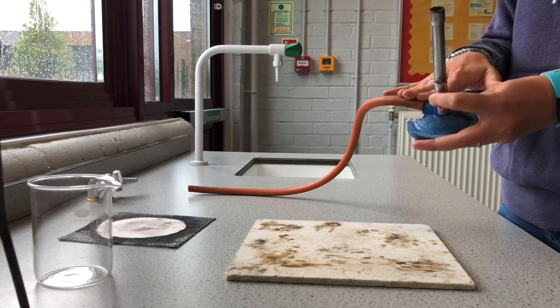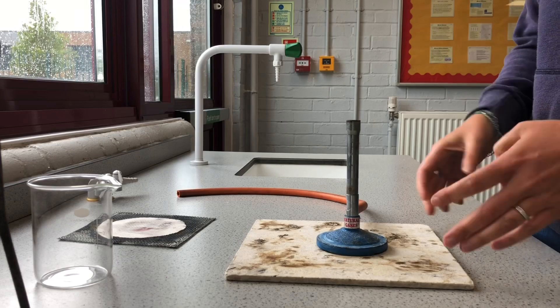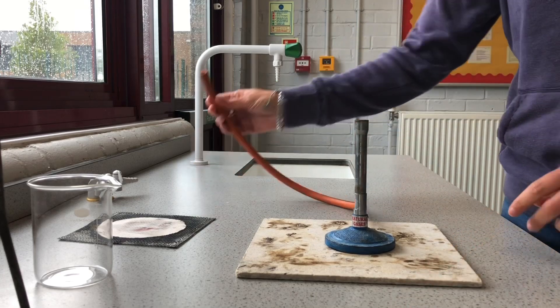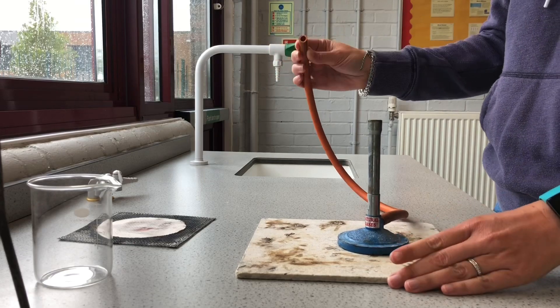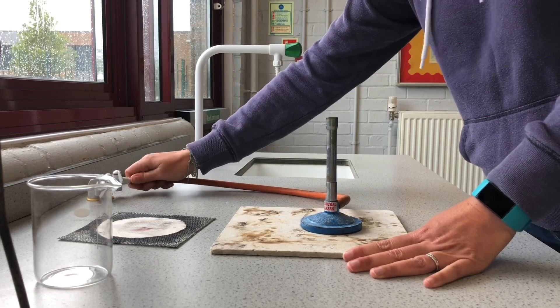We sit it on our heatproof mat, which protects the table so we don't cause any damage. Then we've got the other bit of rubber tubing — we just check this, make sure there are no splits. It can become brittle over time, but that looks good, so I'm going to put that onto my gas tap like that — a nice tight fit for the Bunsen.